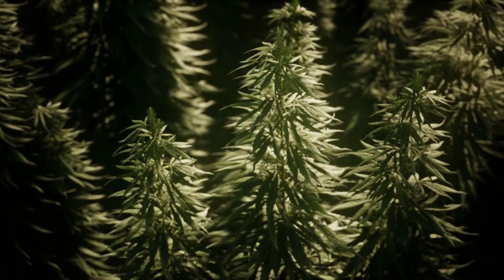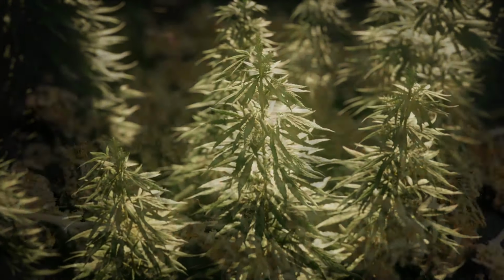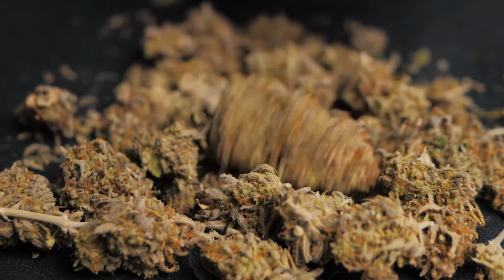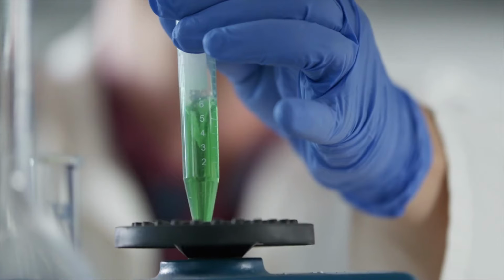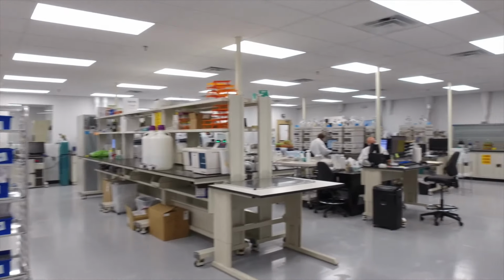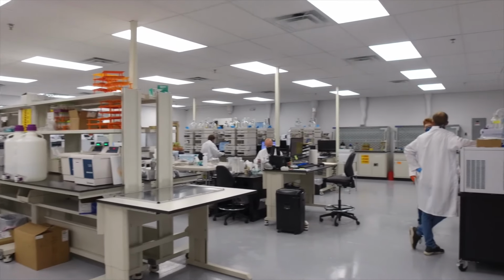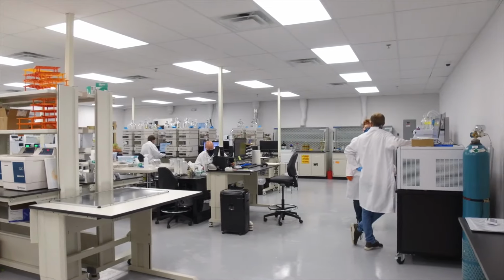The beauty of cannabis is that there's a number of different chemicals, right? Hundreds of chemicals in this. It's very important that your method is tested specifically in cannabis because there are a lot of other interfering compounds in cannabis that you may not see in other natural products, say spinach or lettuce or what have you. Find a lab who has validated their test method in cannabis-specific products.